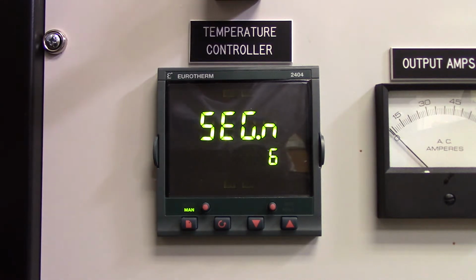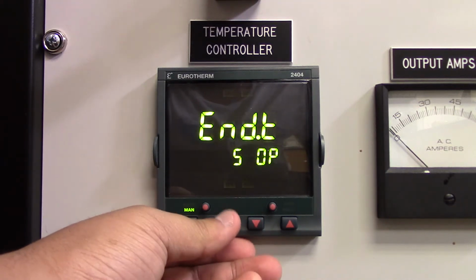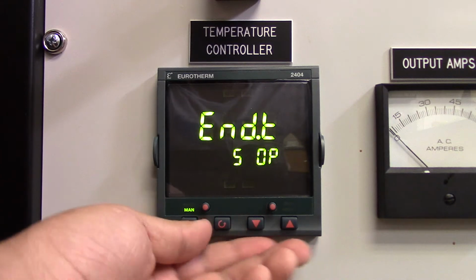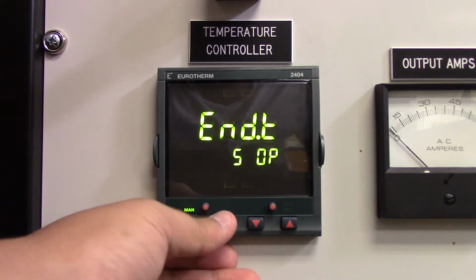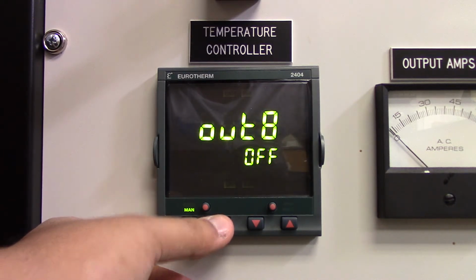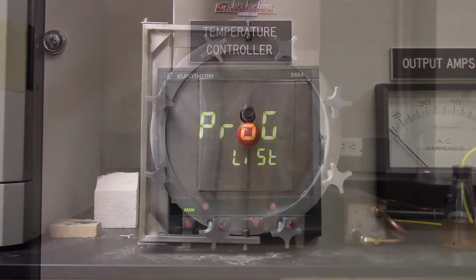Okay, now the entire process is done pretty much, so I'm just going to set the last segment to end. There are different options here, but essentially just tell the furnace to stop. And you don't need to use any gases. And there we go. Now the entire process is done. So now we're going to set this program to run.